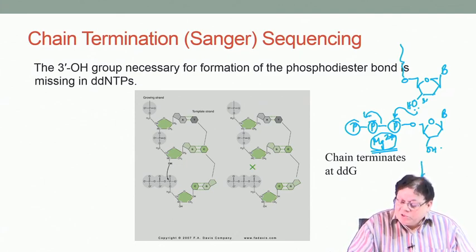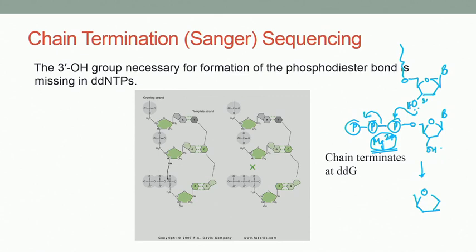In the process you have extended the DNA chain by one nucleotide. Okay. So, this was the earlier DNA part. Then this again attacks another triphosphate, and that is how the DNA chain is extended. So, this is the principle.